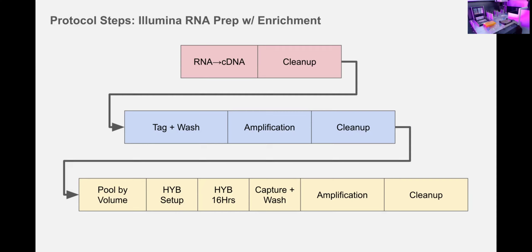So you see in the center, previously what we started with is just the Illumina DNA prep. This is, for those who are unfamiliar, just Illumina's basic tagmentation. So the tagmentation is using a bead transposon to simultaneously tag and frag your DNA molecules simultaneously.